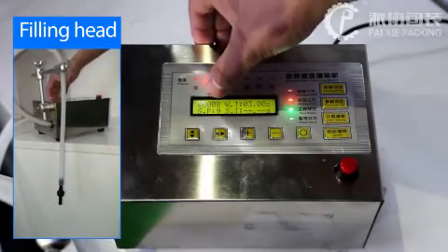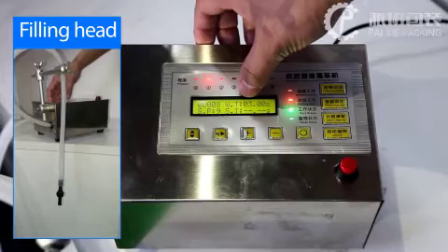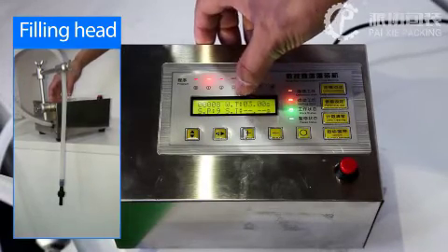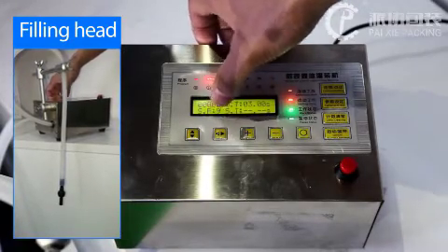You can see the count, the feeding speed, the feeding time, and the feeding speed.